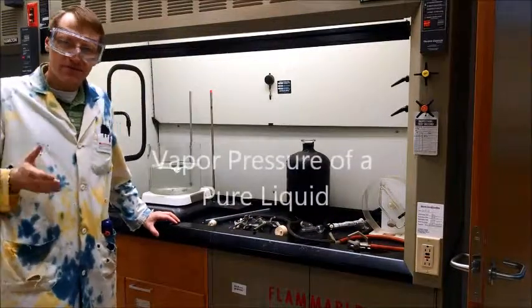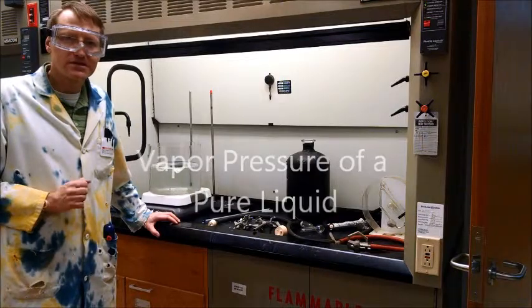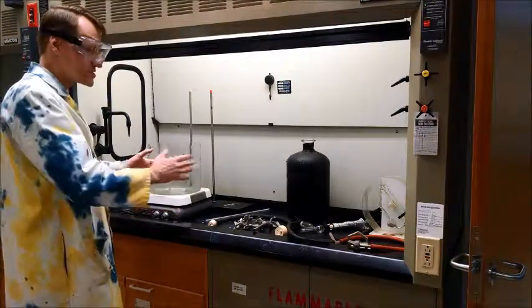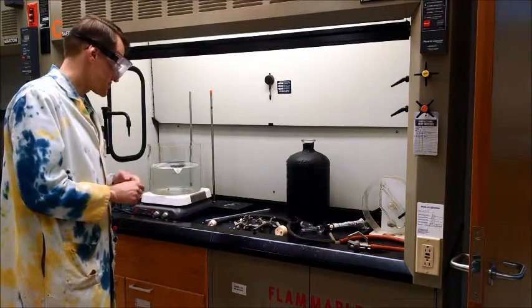We're going to measure the vapor pressure of a pure liquid by using the isotenscope method mentioned in your handout. I'm going to show you here how to set up the experiment using the isotenscope.